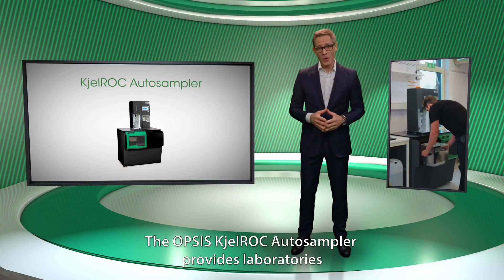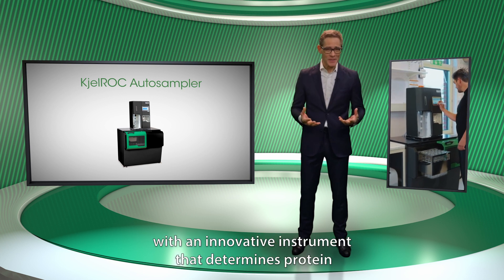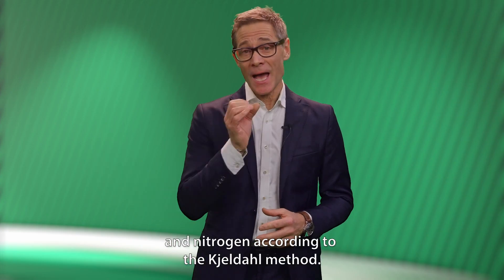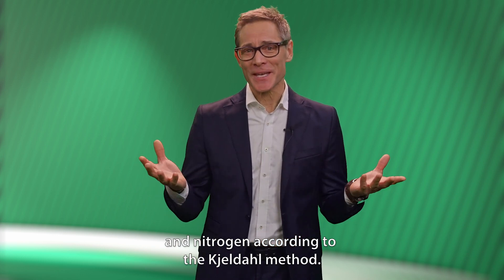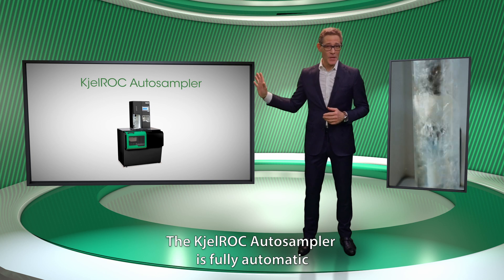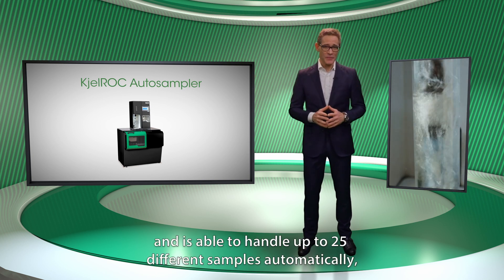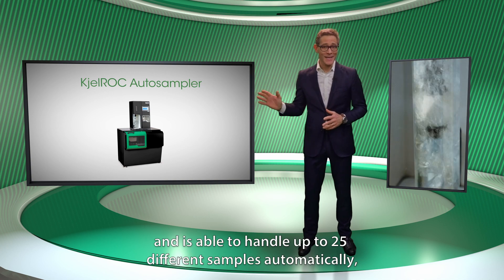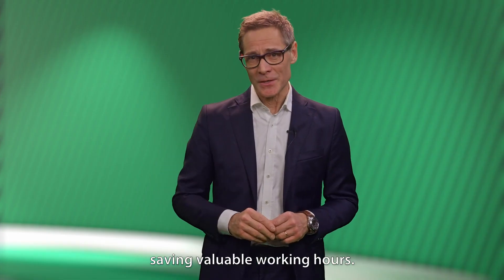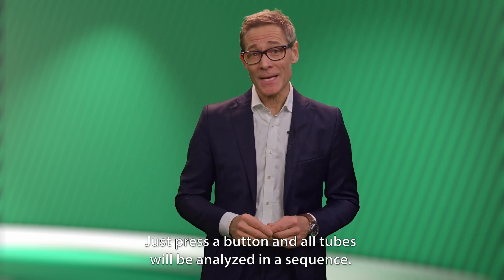The Opsys Kellrock Auto Sampler provides laboratories with an innovative instrument that determines protein and nitrogen according to the Kjeldahl method. The Kellrock Auto Sampler is fully automatic and is able to handle up to 25 different samples automatically, saving valuable working hours. Just press a button and all tubes will be analysed in a sequence.